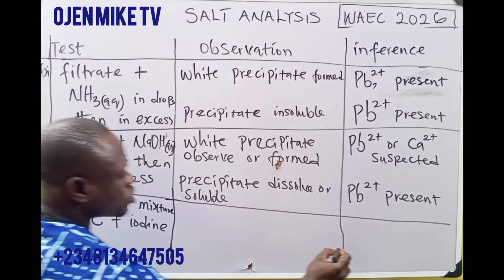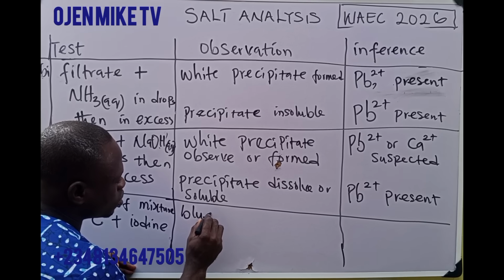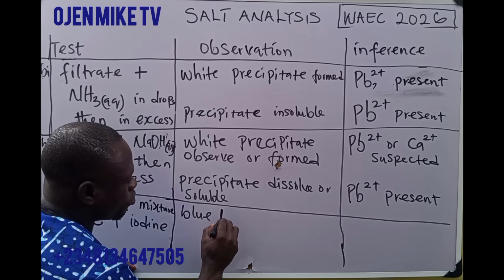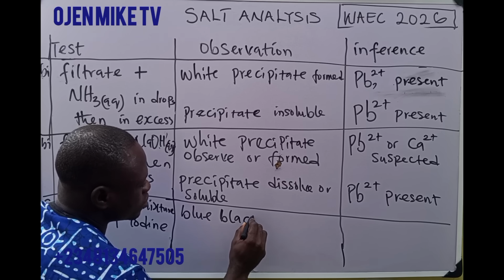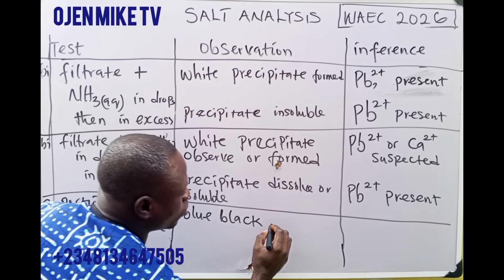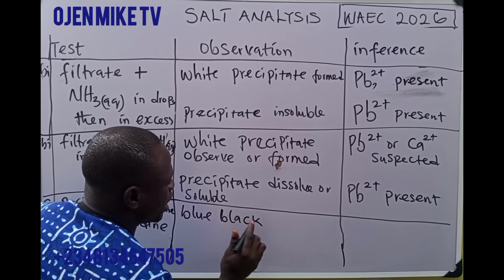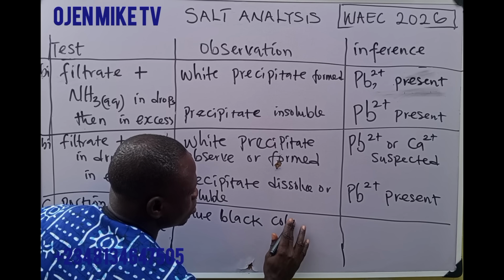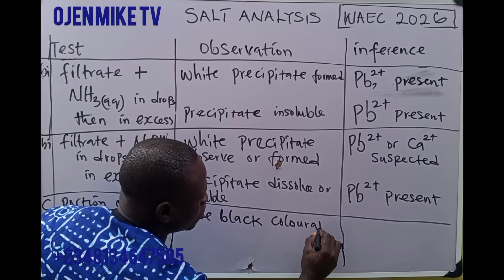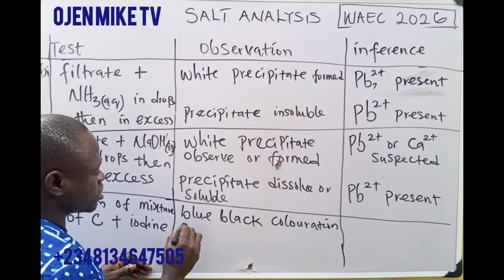So what you are going to see in your observation is blue black coloration. Some say blue black coloration observed.